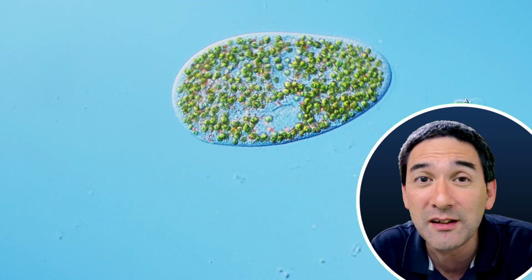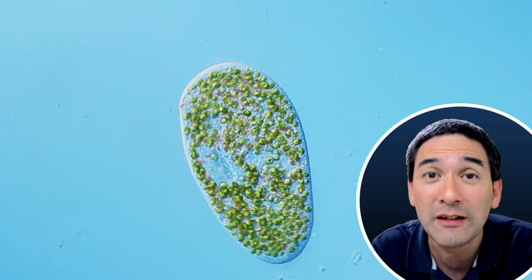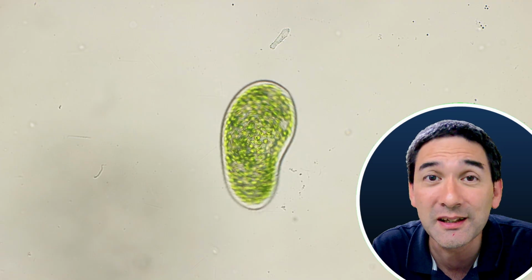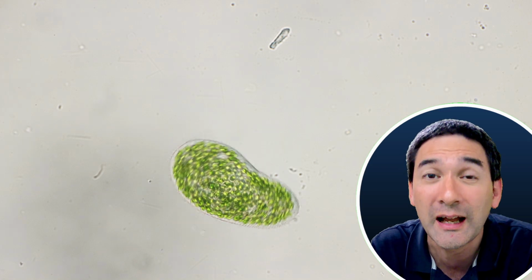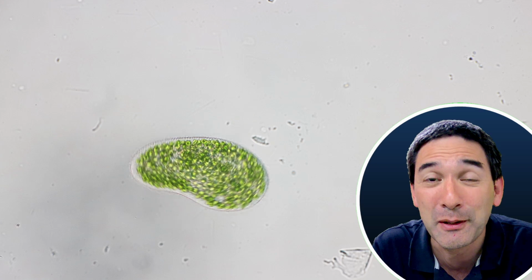Now, what you can see is that there are probably several hundred of these Chlorella algae living inside the cell. And then, of course, when the Paramecium divides, the two daughter cells will also have their own share of those Chlorella algae. And then those Chlorella algae also divide, of course, inside the Paramecium.